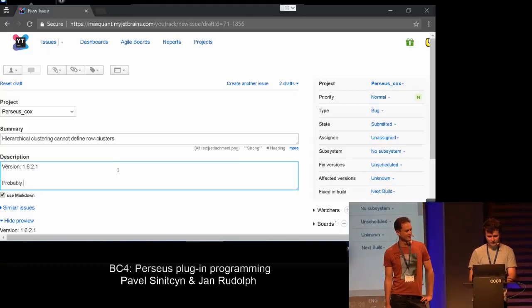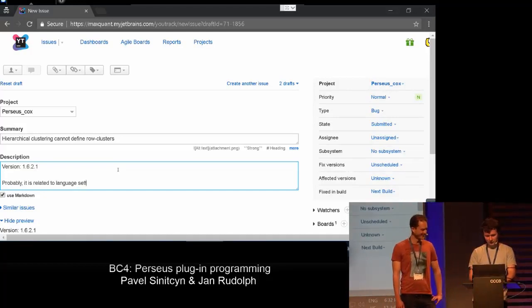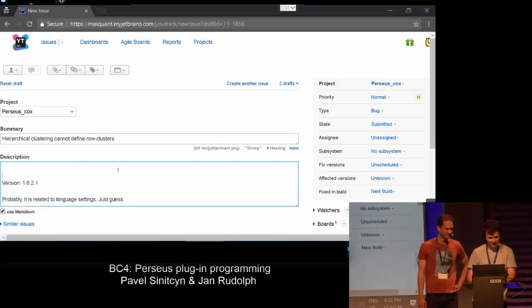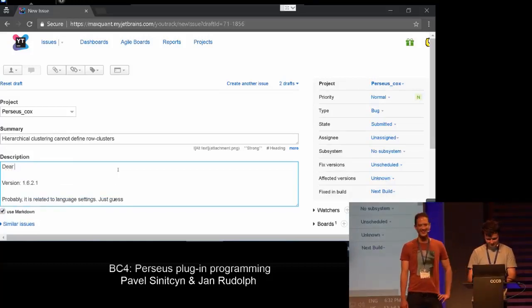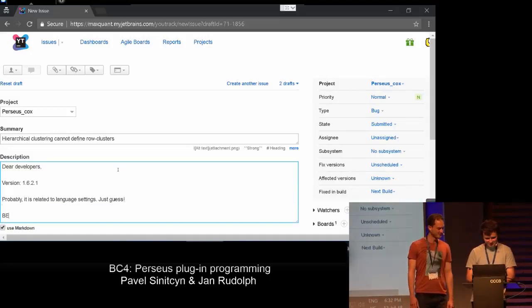it is related to language settings. Okay, just a guess. Yeah, and actually you should be polite. I should write dear developers. Or hey Pavel, that also works. What? No, it's not true. I mean, it's actually just a guess.